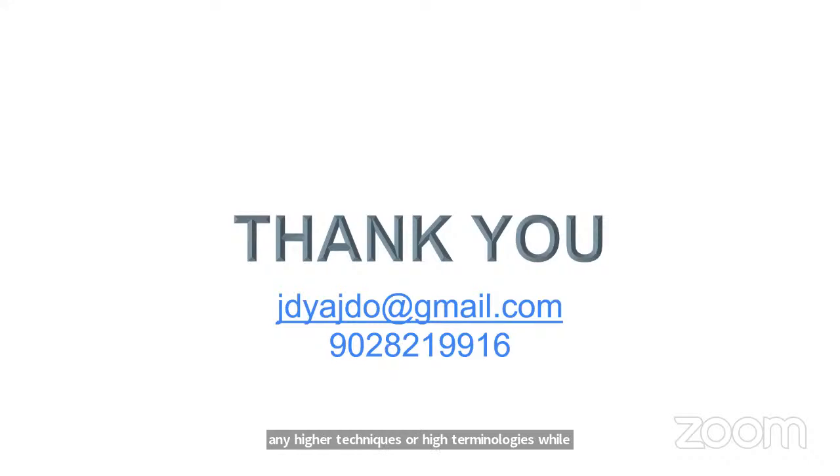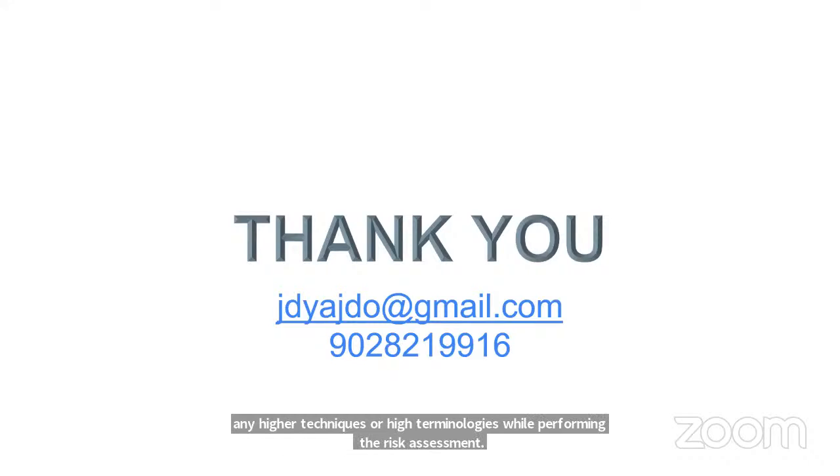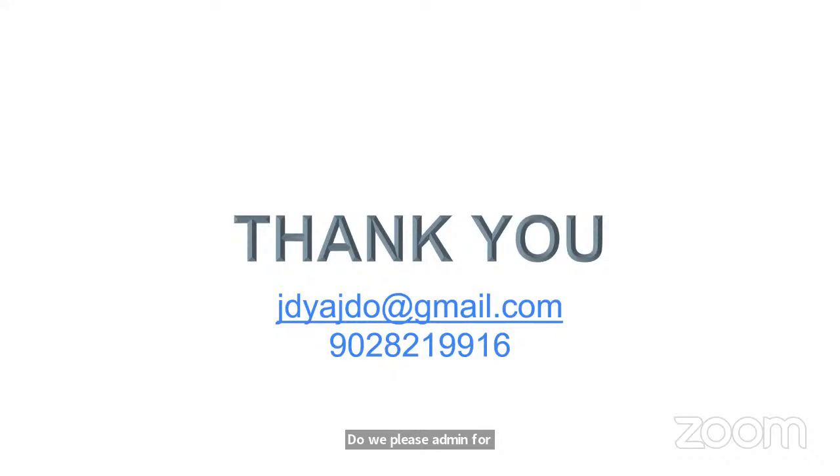Do we fix lab mean for hematology controls? I have already mentioned there is no need, because the value changes very frequently. Is it mandatory to do method validation on the frequency with changes? I think you have missed the previous classes. We are not going to do any method validations in our laboratory. We are only performing method verifications in our laboratory.